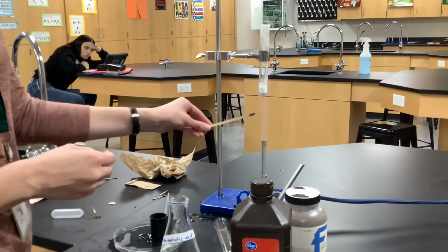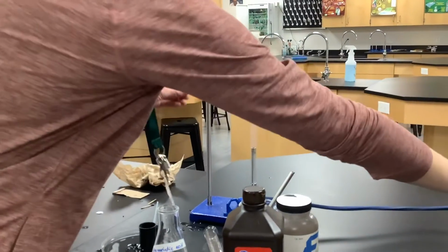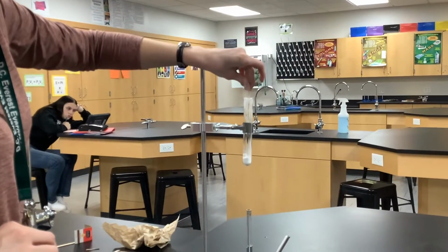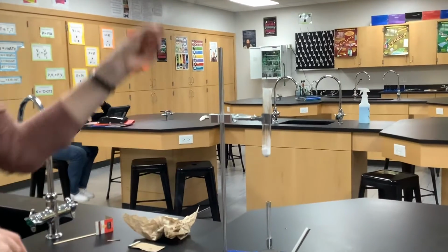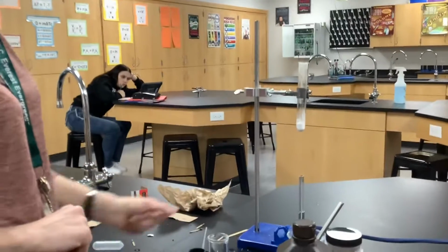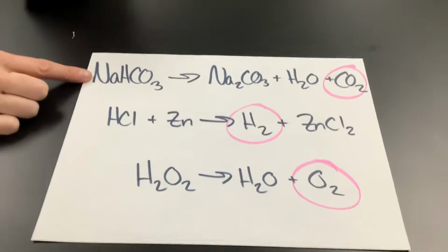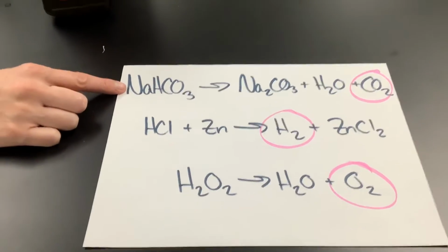All right, should we try it? And there it goes out right away. Wow. And if we lit it again and put it back in there, it would go out again. Okay, so that's the first reaction, producing carbon dioxide and then testing for that carbon dioxide to see if it does smother the flame.